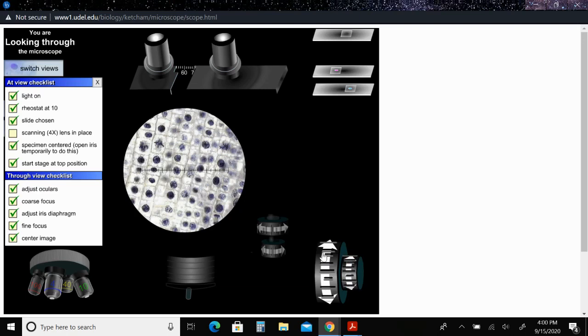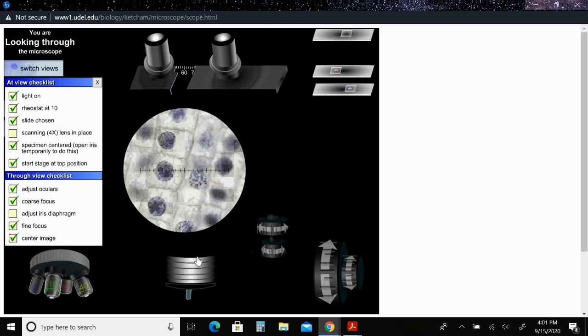There we go. All right, so what you can see here is you can kind of see the square outline of these cells. So that would be our cell wall. Say the big purple thing in the middle is going to be your nucleus. All right, and in here we actually see a couple of these cells undergoing mitosis. So they're in various stages here. Let's go ahead and zoom in and get another look.